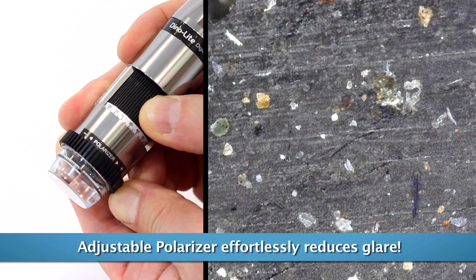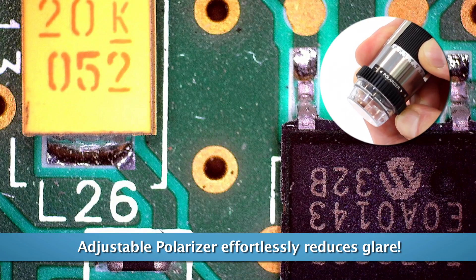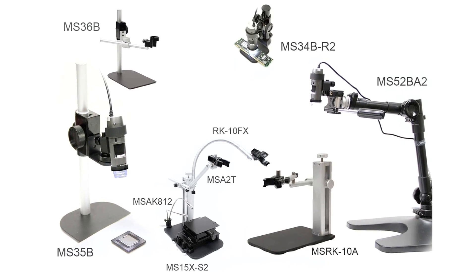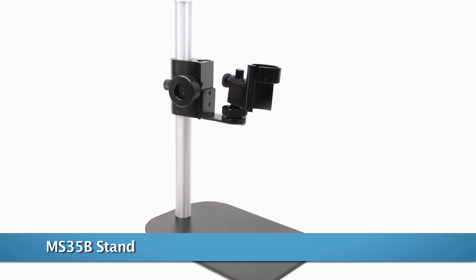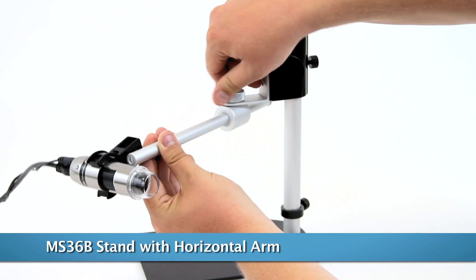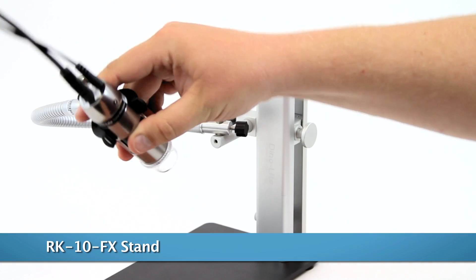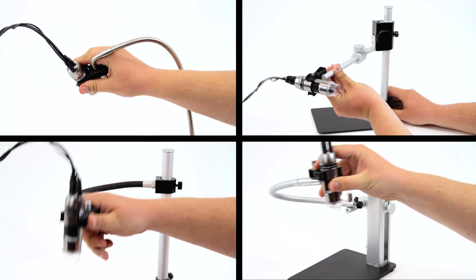The built-in adjustable polarizer provides more clarity and reduces glare on reflective surfaces. There are many compatible and recommended accessories, including the MS35B, MS36B, and RK10A tabletop stands with varying design features, but all include a fine adjustment knob for precise movement and options for angled viewing.